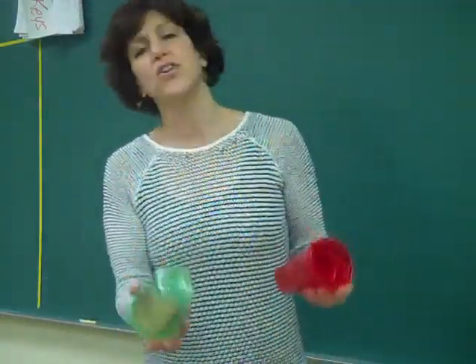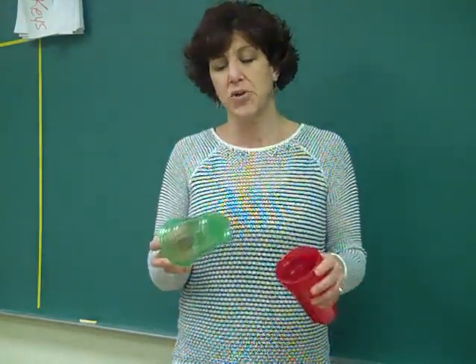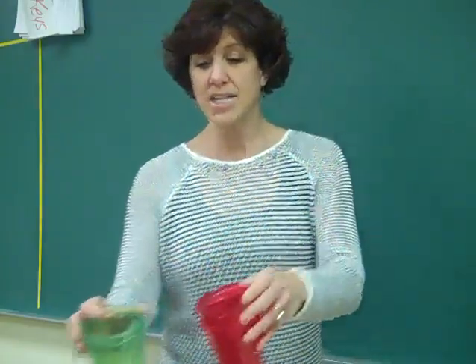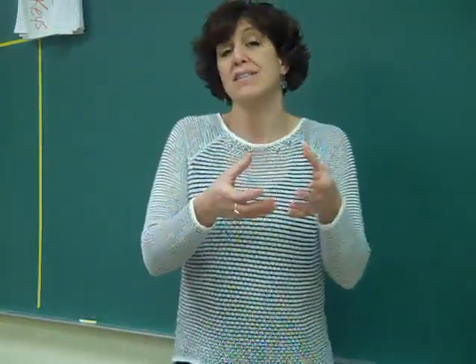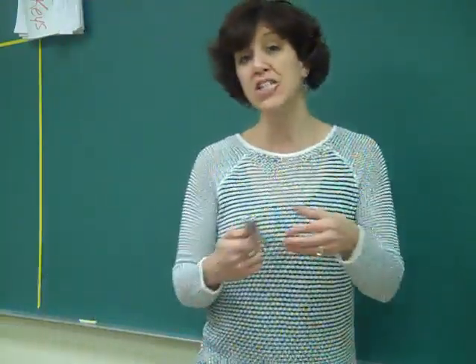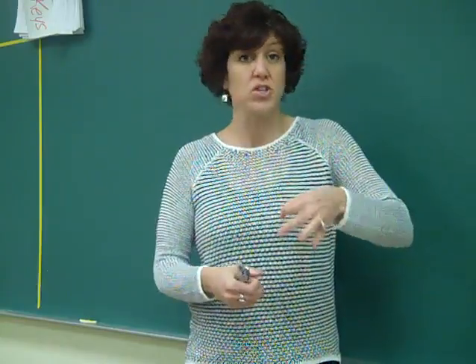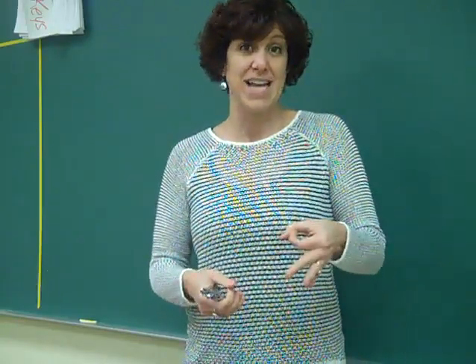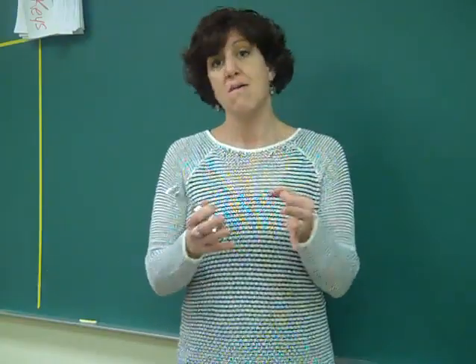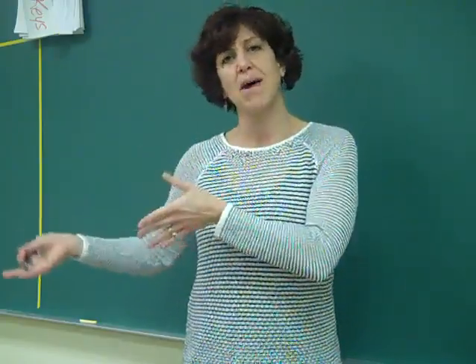Another experiment that you're going to run, I'm going to give you choices. You can decide what you'd like to do. Here's an example. I have red cups and green cups. And you are going to first run the experiment as a control with just a clear cup. What you do is you take spinach leaves and you use a hole punch. And you punch out circles, which makes them all the exact same size, which works out fabulously because we can calculate the area of the leaf that we're using quite easily. And we can make sure that we have a constant amount in each one.